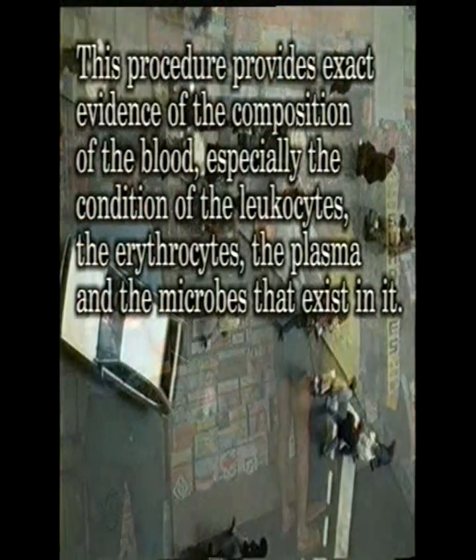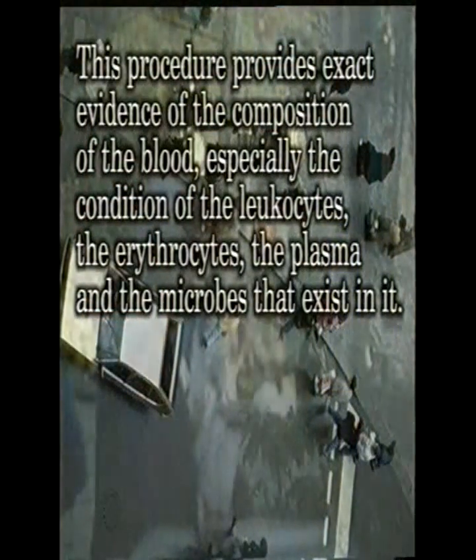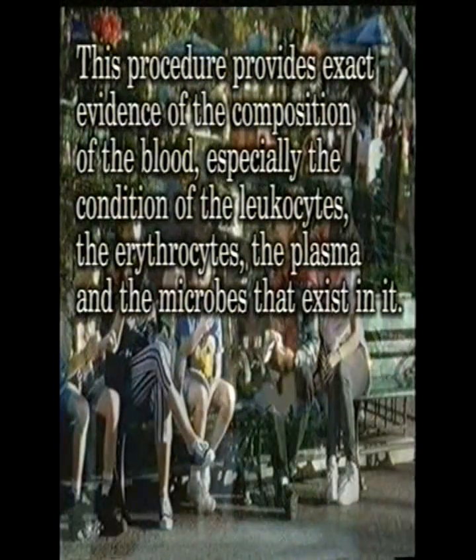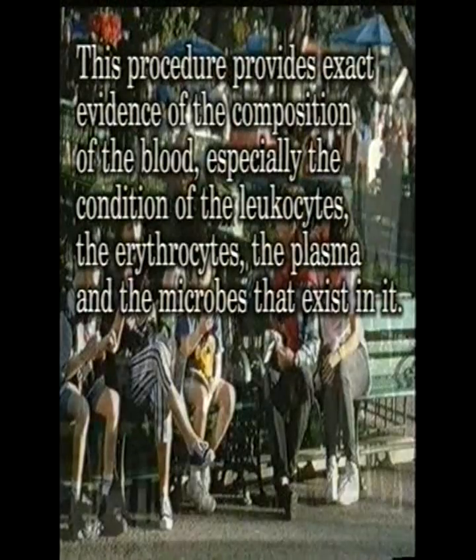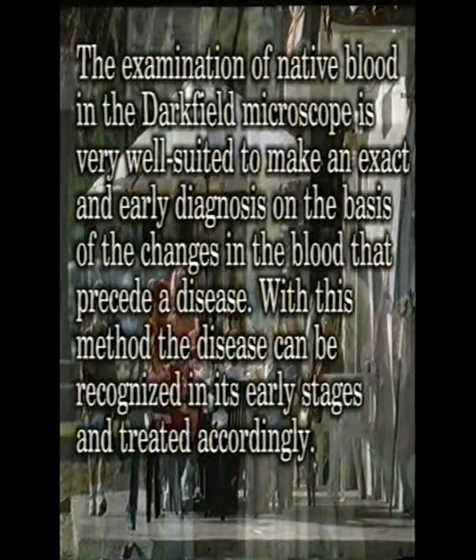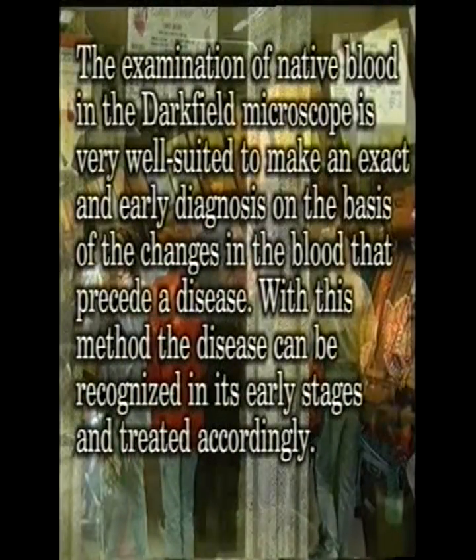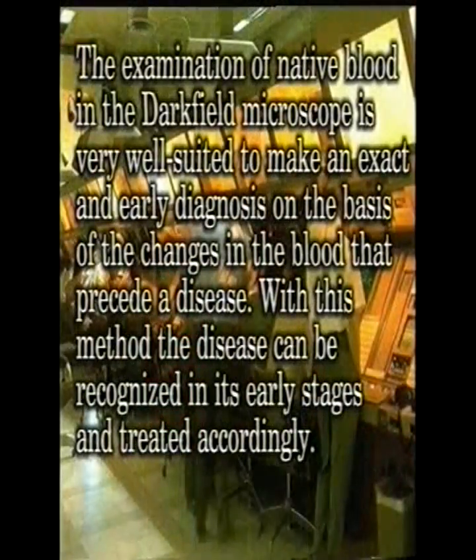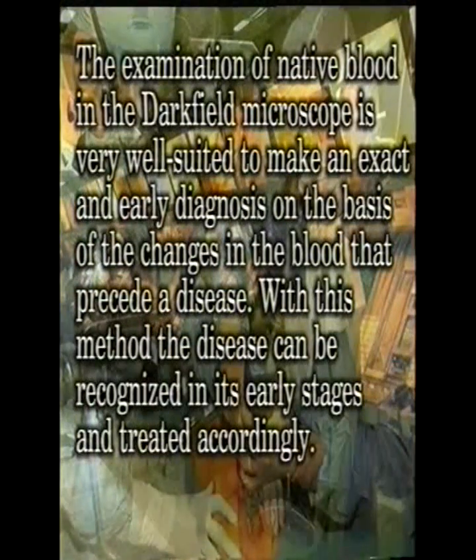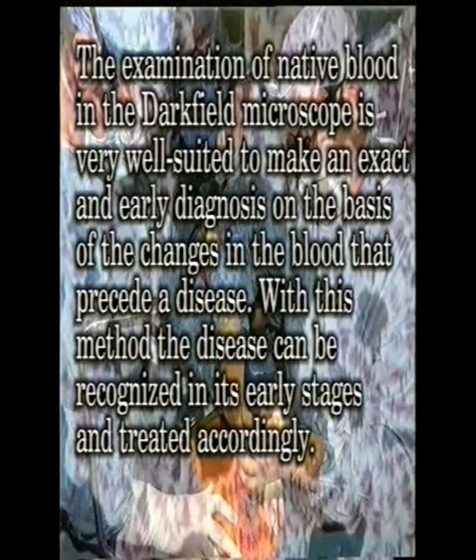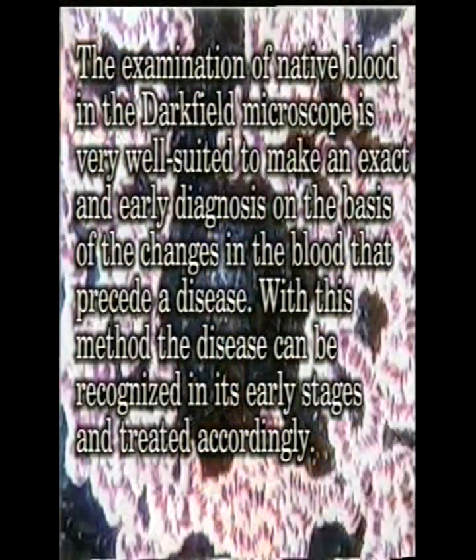This procedure provides exact evidence of the composition of the blood, especially the condition of the leukocytes, the erythrocytes, the plasma and the microbes that exist in it. The examination of native blood in the darkfield microscope is very well suited to make an exact and early diagnosis on the basis of the changes in the blood that precede the disease. With this method, the disease can be recognized in its early stages and treated accordingly.